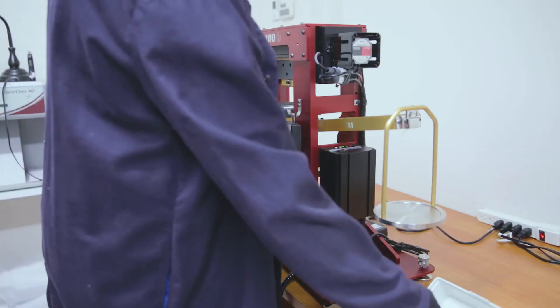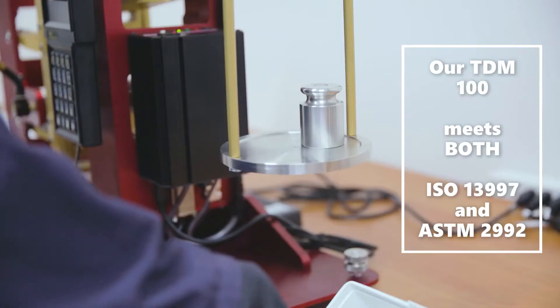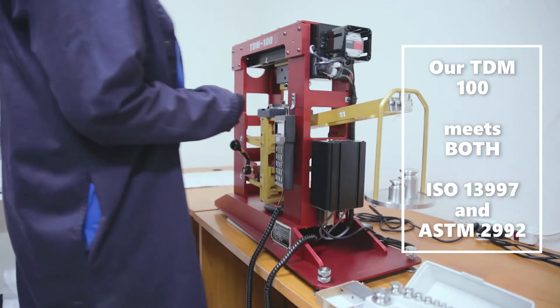Cut resistant properties are rated for glove materials using the ANSI ISEA 105 specification for hand protection or a similar European specification for gloves, EN 388. Both specifications reference testing on the TDM 100 apparatus used by methods ASTM F2992 and ISO 13997.